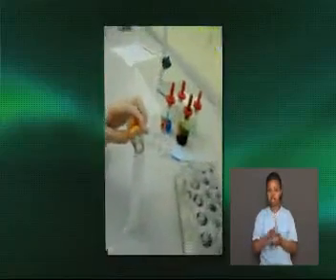The next test we will look at is the emulsion test. This test requires dry test tubes, ethanol, water, and a substance to test.